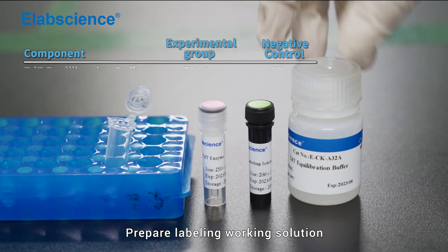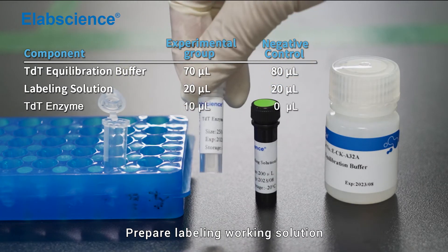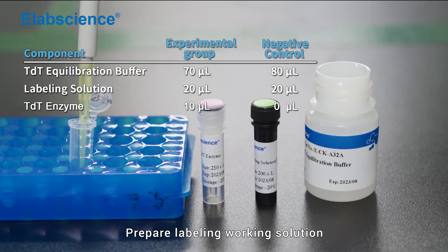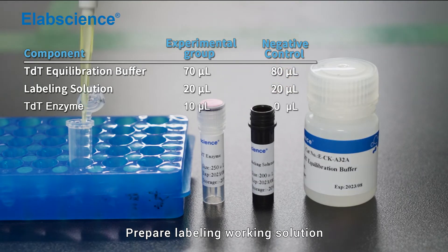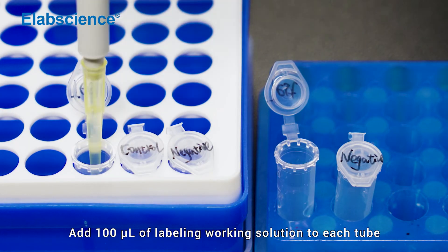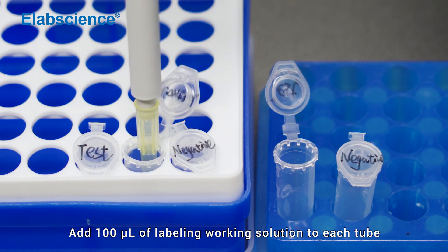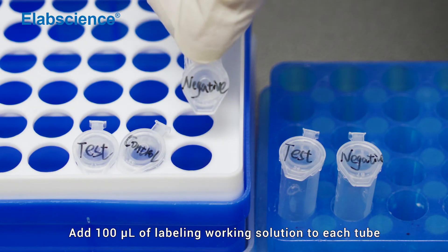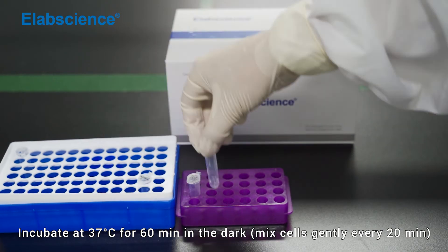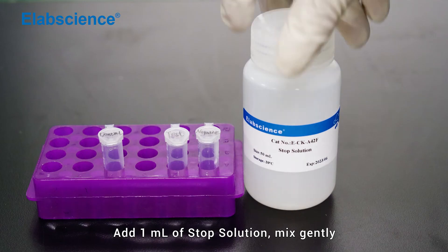Prepare the labeling working solution. Add 100 µL of labeling working solution to each tube. Incubate at 37°C for 60 minutes in the dark. Add 1 mL of stop solution and mix gently.